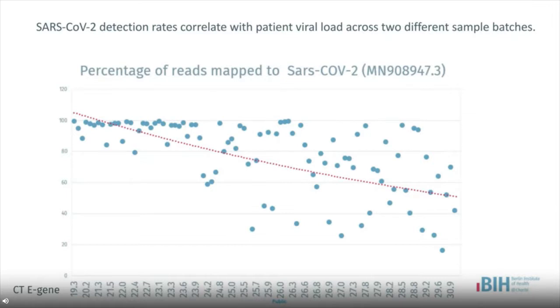So in order to facilitate alignments, QC analysis, and tertiary analysis of generated data, we have implemented our own bioinformatics workflow.